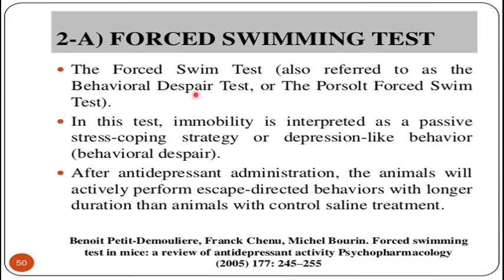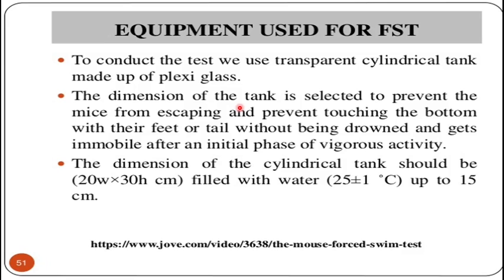The forced swim test is also known as the behavioral despair test, or the Porsolt forced swim test. These are both names of the forced swim test. In this test, immobility time is measured to find out the depression-like behavior.